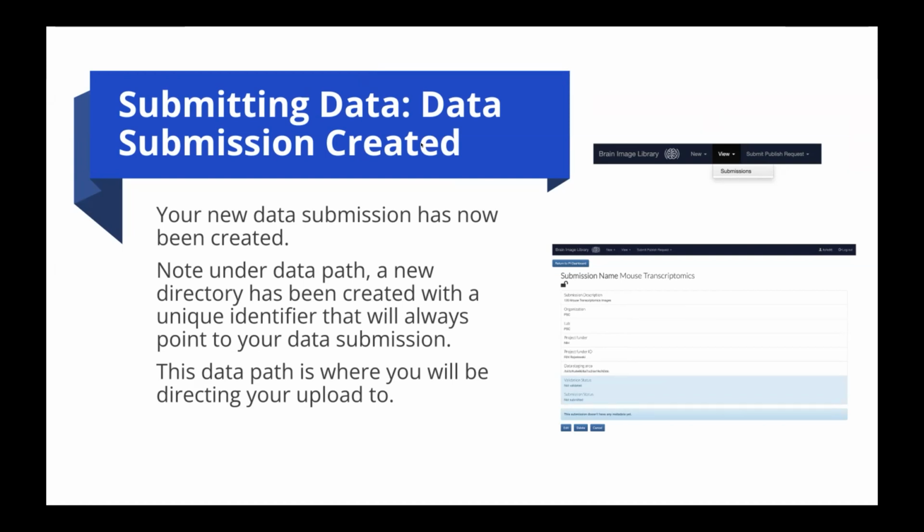Yeah, it has a name, funded by, BICCN personnel submissions. So then do you submit to the project? Yeah, if you were ready to point a submission to a batch of data to that project you're submitting for, you would choose that in the form. Okay, where do you choose? Think of the project as a tag that goes along with your data.